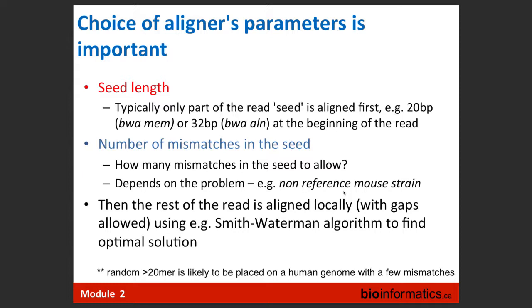And the question to you may be, why? If I have a 75 base read, why don't I want to align the 75 bases right away? Because, of course, the chance of polymorphism is high in 75. That's one, and then we will be in trouble.